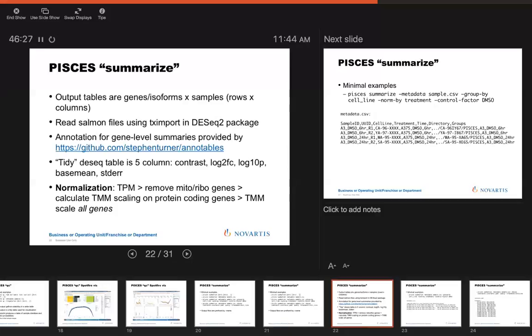The mitochondrial genes that are encoded on the mitochondrial chromosome, you know where that came from. But anything that's autosomal, that's highly abundant in your sample before you do any normalization, that's probably real, right? So then the question is, if you want to do differential comparisons on the subsets, say like mitochondrial genes that are on the autosomes, then how do you normalize your data? There's a real difference. Yeah, it's biologically real.